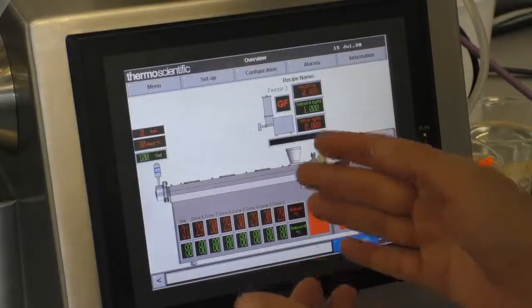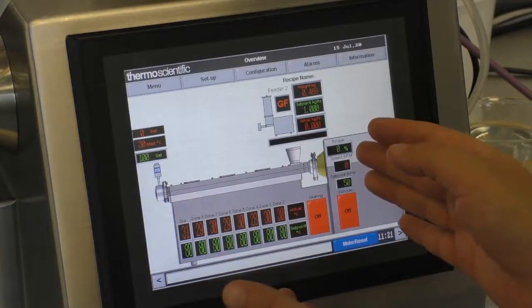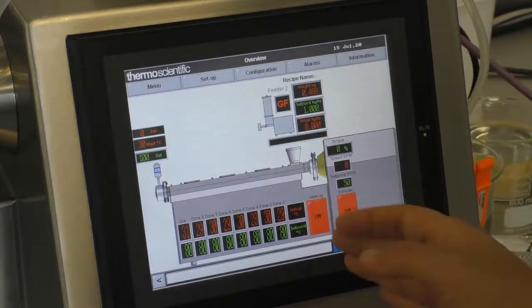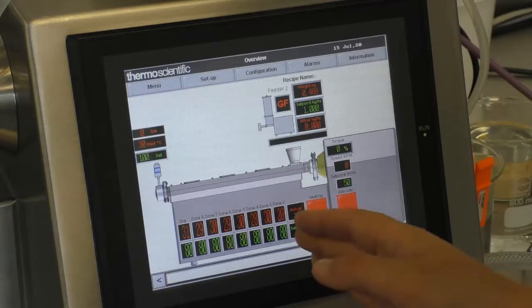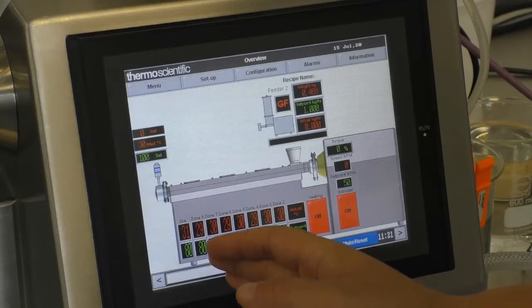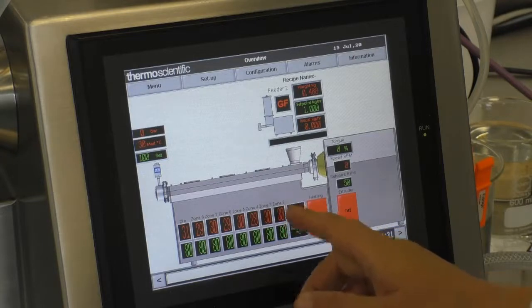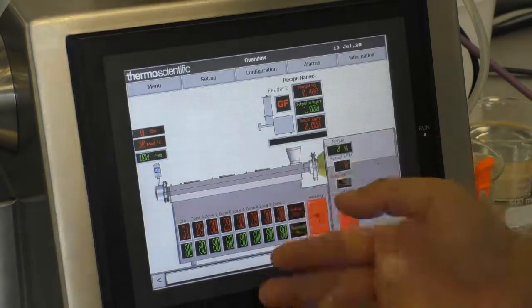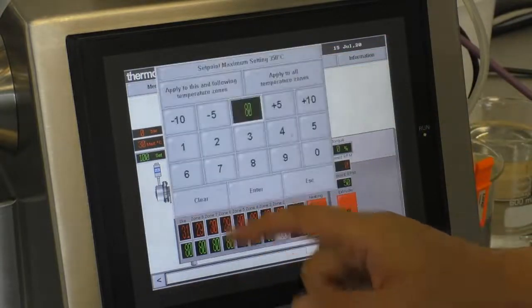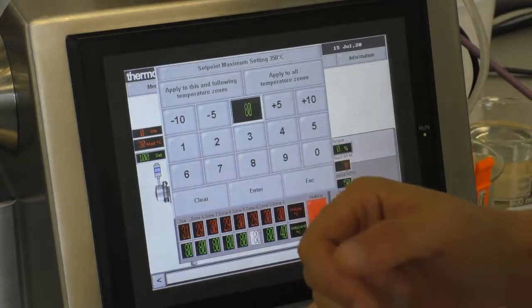So now what we'll do next is to set the process settings by using the integrated touchscreen of the extruder. Here we start first of all with setting the temperature zones. You can see that we have 8 different zones that can be heated or cooled separately from each other. I will start with zone 2. To explain, zone 1 is the feed of the material, and we start heating in zone 2. Here we use a low temperature because we don't want the material to burn right away.